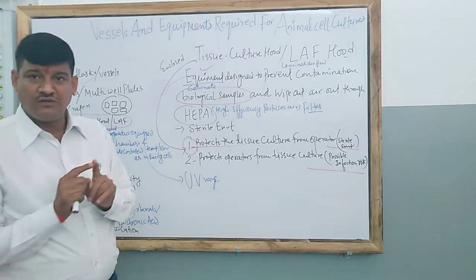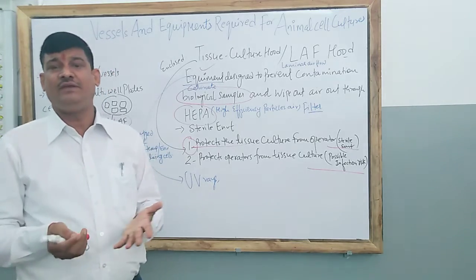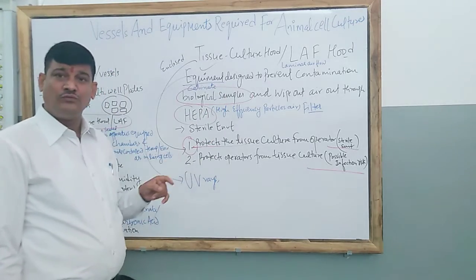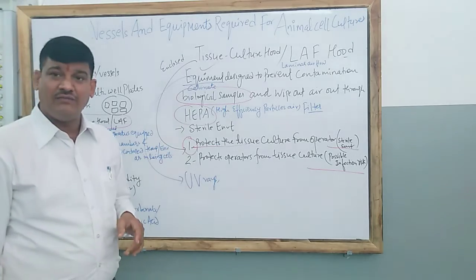So what is the tissue culture hood? The tissue culture hood is an equipment, a sealed cabinet, and this sealed cabinet is basically used for keeping the biological samples, and it also has the HEPA filter.